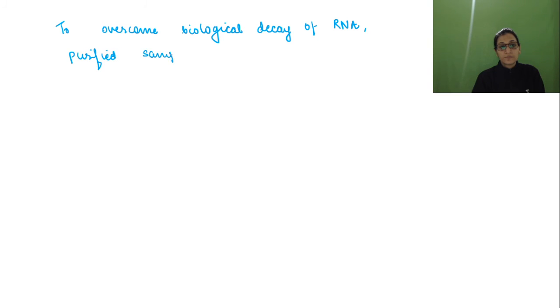So to overcome biological decay of RNA, purified samples are stored at minus 20 degrees Celsius as ethanol precipitates.